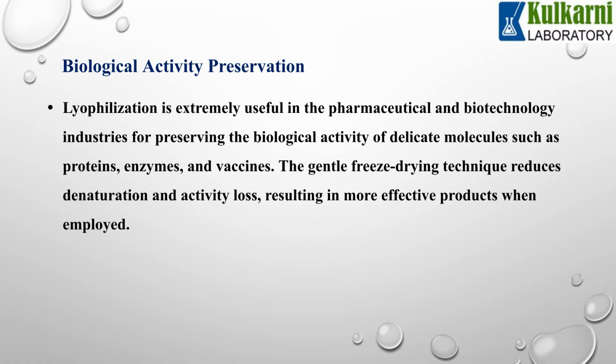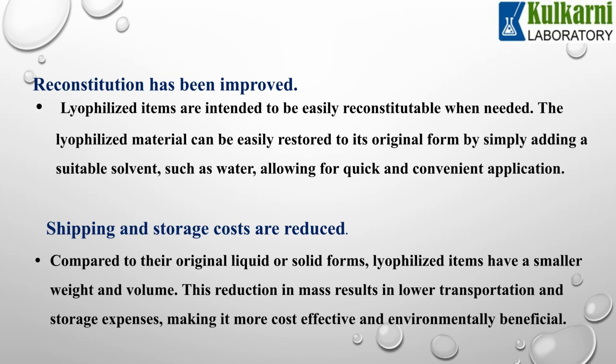Lyophilization is highly valuable in the pharmaceutical and biotechnology sectors for preserving the biological activity of delicate molecules like proteins, enzymes, and vaccines. This gentle technique reduces denaturation and activity loss, leading to more effective products. Lyophilized items are designed for improved reconstitution. They can be quickly restored to their original form by adding a suitable solvent. Furthermore, the reduced weight and volume of lyophilized products lower transportation and storage costs, making the process more economical.